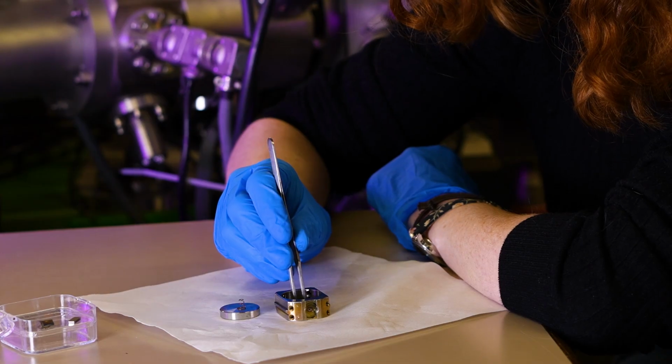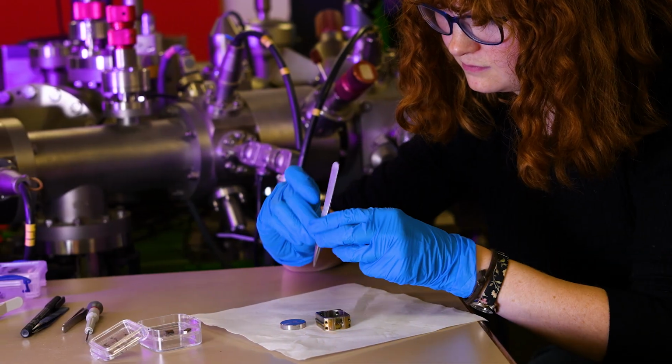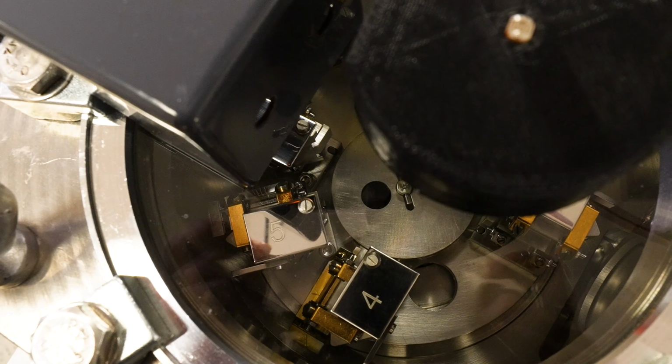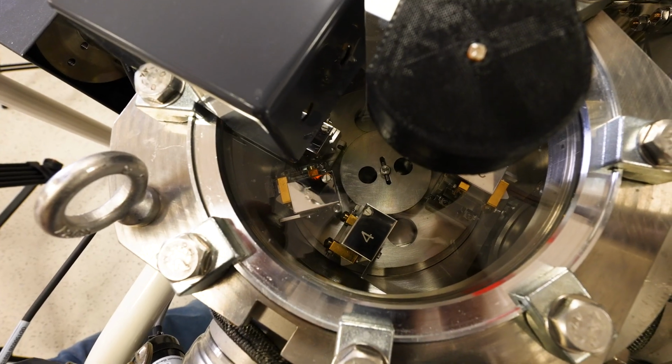Right at the start of the project, obviously the first thing was to prepare samples. We're all aware that with microscopes, you need to have a good sample first before you go into the microscope. It very much dictates the quality of the results you get. We were able to get unprecedented access to a sample set from Rolls-Royce of ex-service material, which was fantastic because that put us in a position where we were able to develop a method using the material system that we would actually be seeing if we were to take this into a commercial setting.